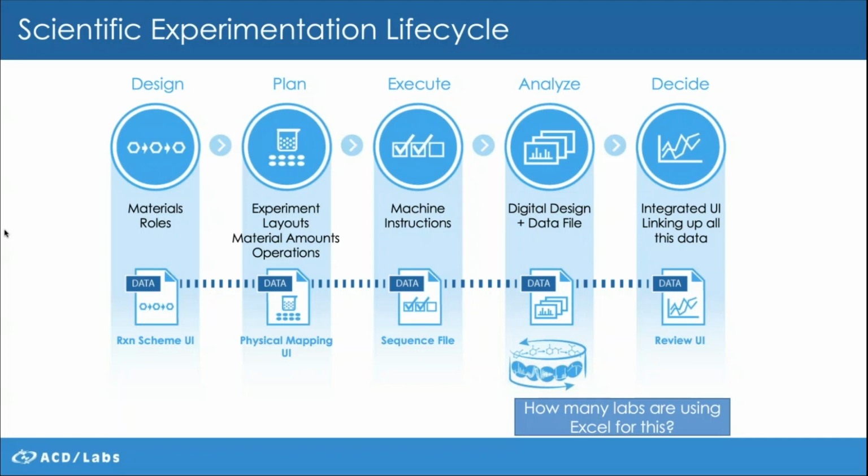What we have found is that in between these unit operations, data has to be transposed between software systems. And in order to perform that integration without dedicated software systems, you use abstraction and push data into applications like Excel in order to make effective decisions. What we've also found in working with our early adopters of this platform is that they end up spending more time transposing data between software systems than actually executing experiments.